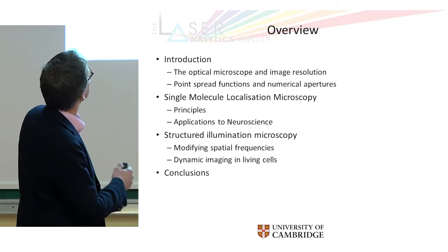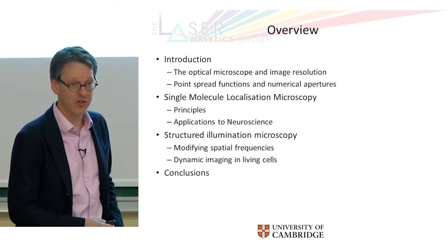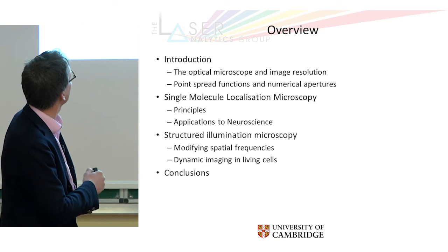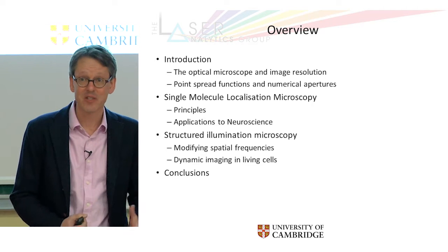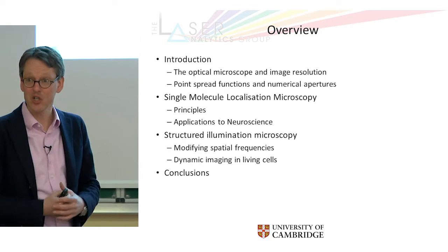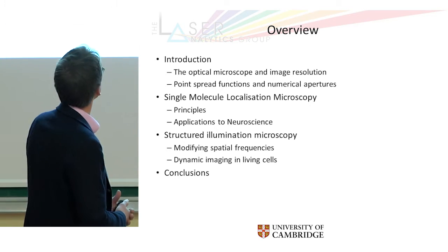The first technique is called single molecule localization microscopy. I will talk you through the principles of how this works, and then applications from our own laboratory of this technique, where we look at problems of neurodegeneration, how neurons die in the process of proteins going crazy inside cells.